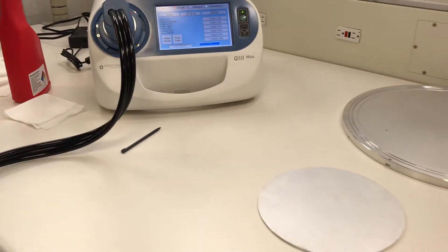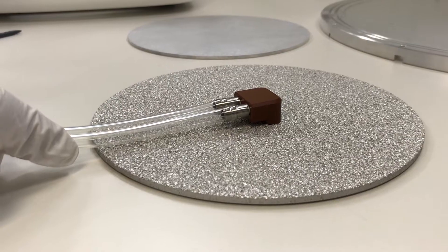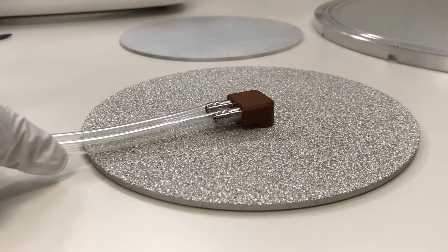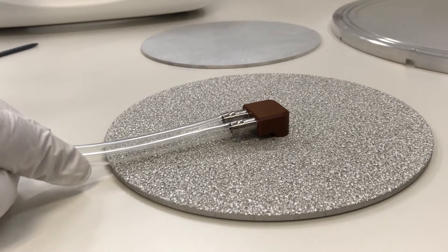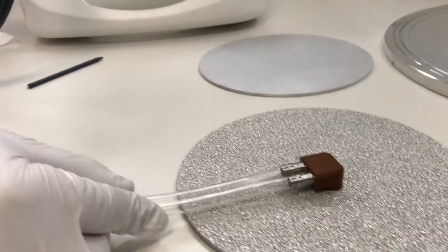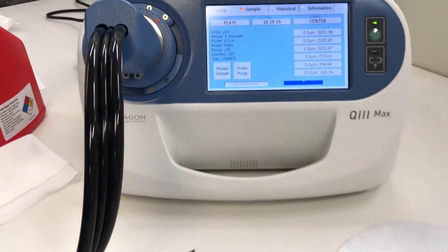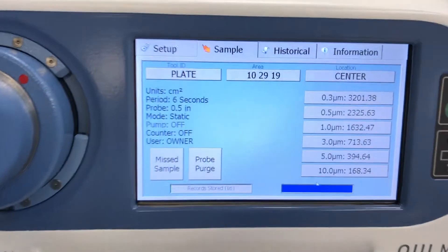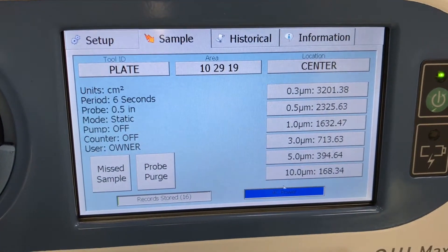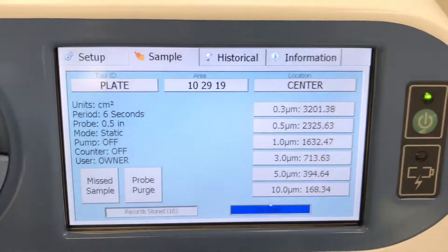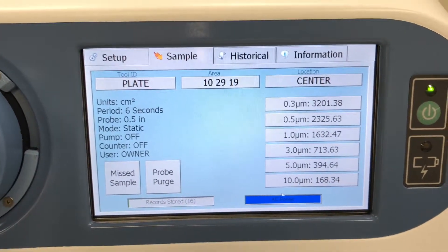Now we are measuring a rough surface. It is very difficult to detect particles with the human eye on a rough surface. However, the Q3 can quickly make these measurements. The results show the surface is contaminated with 3,201 particles greater than 0.3 micron per centimeter squared.